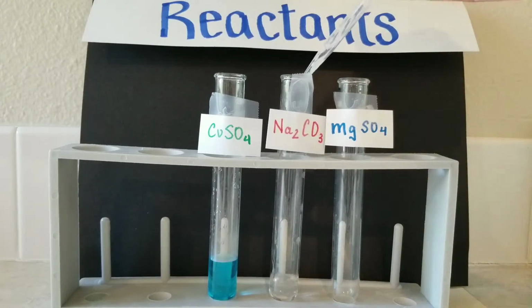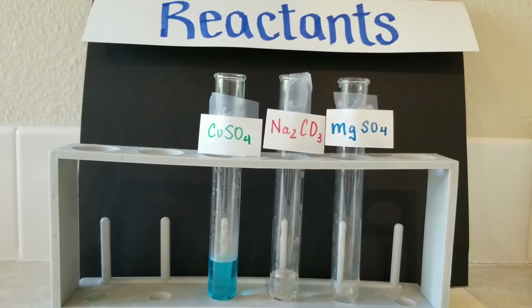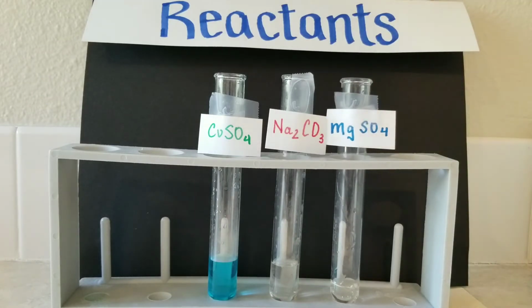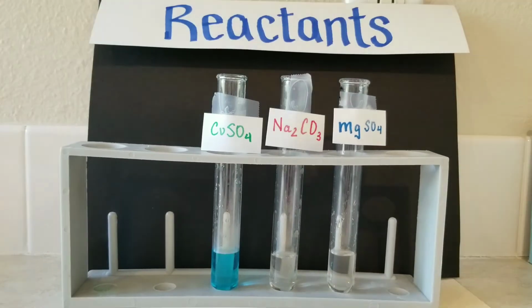It doesn't look as pretty as the first one there, but this way you have an idea of what the reactants look like. And the last one is called magnesium sulfate. So magnesium sulfate, we'll put in this last one so you can get an idea of what the visual properties of the substances are. We're going to take these substances and put them together to see what it is that will happen.